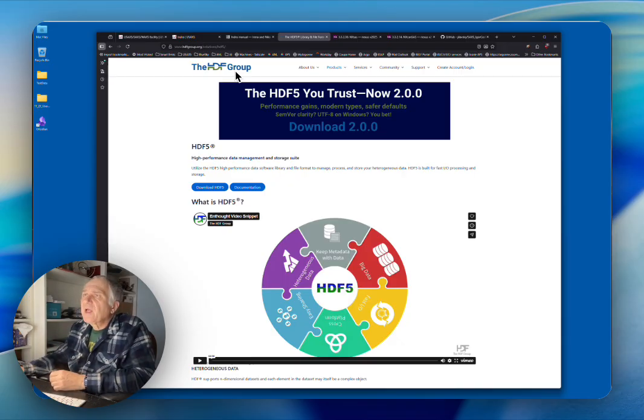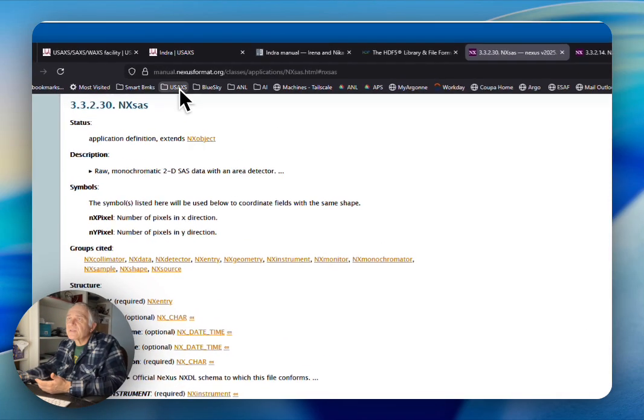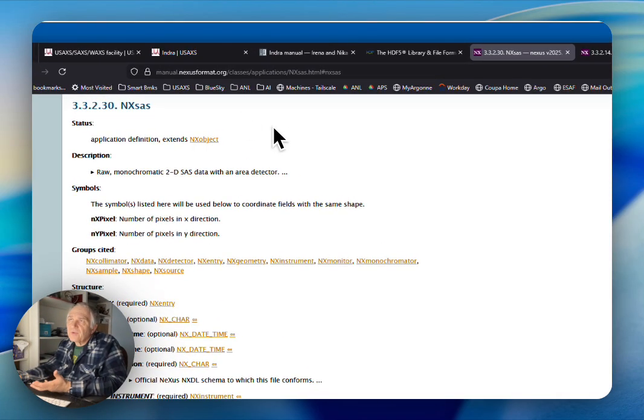Our data follow 2 different standards for small angle scattering. So there's an NXsas standard. A group of scientists got together and created something called the NeXus format. NeXus format is basically an agreement on how we are going to structure the data inside, and what type of metadata and keywords we are going to use, and how we are going to attach things, so different applications can understand the data.